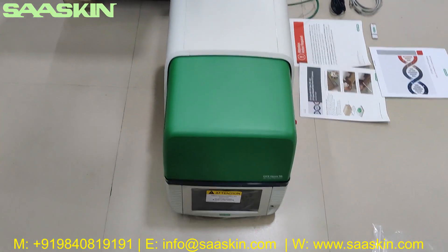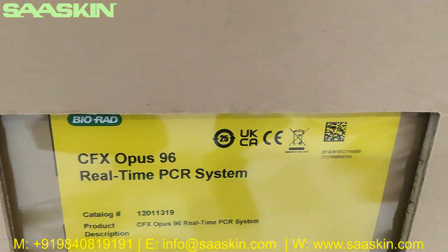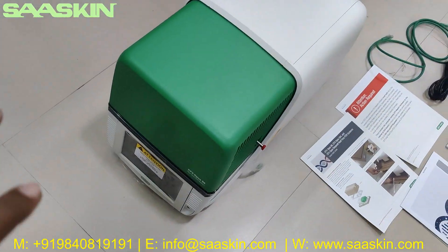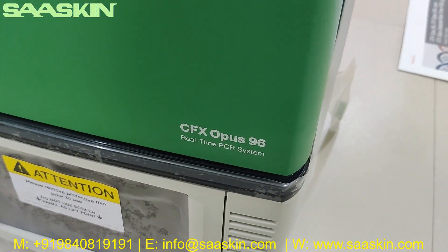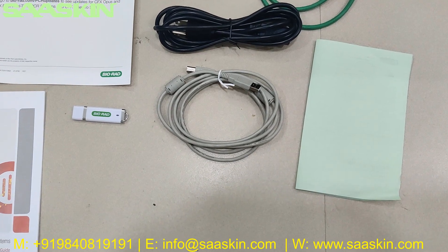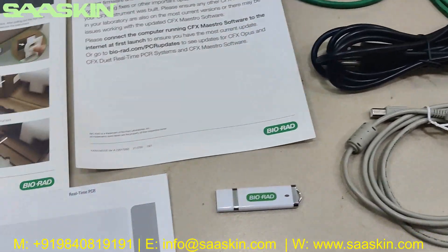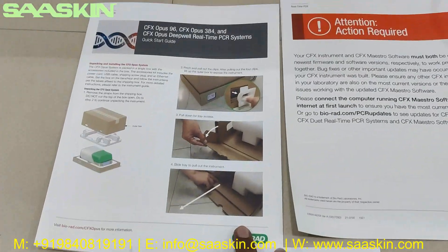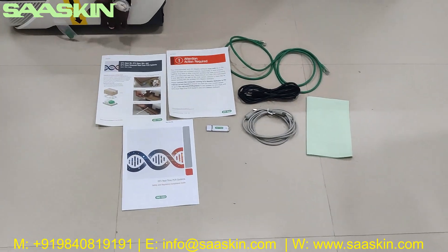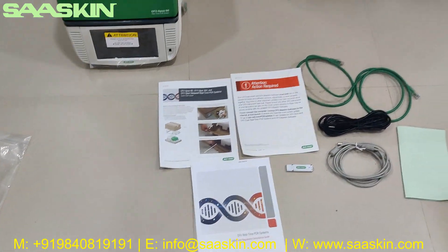This is how the CFX Opus machine looks on the whole. To summarize: we're unboxing the CFX Opus 96 real-time PCR system from Bio-Rad. Inside the box you get the complete machine, a network cable, power cable, system cable, a pen drive, an instruction manual, a safety and regulatory compliance guide, and a quick start guide.